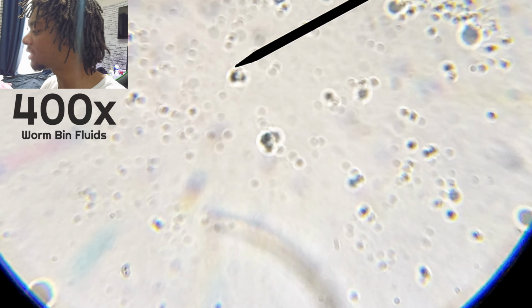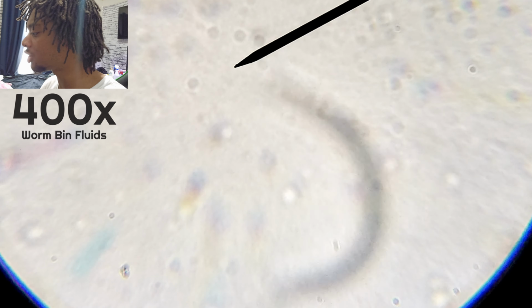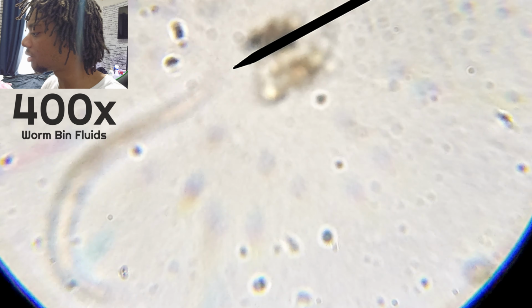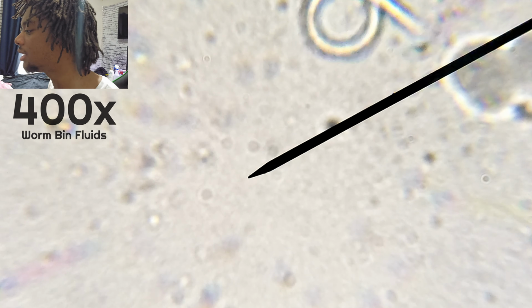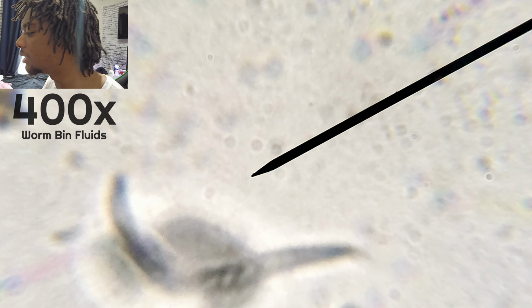Dude, hold still. Dang. Chill for a moment. Look at that. Well, we found something at least. It's not a ciliate, but it is indeed a nematode. What kind it is, I don't know, nor do I know how to test for what kind it is.